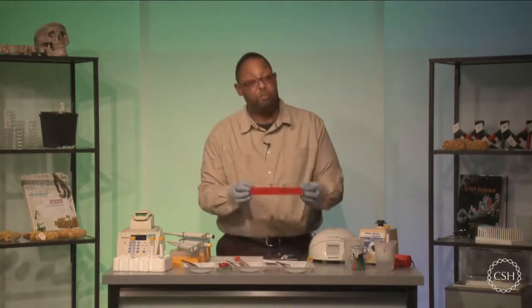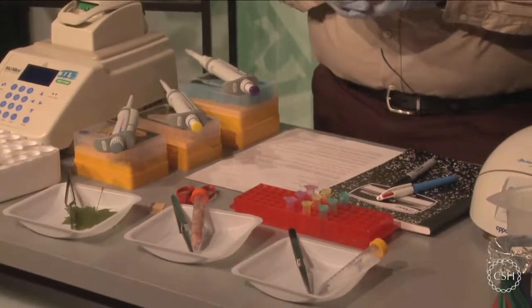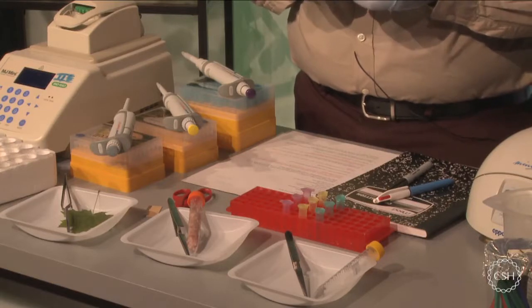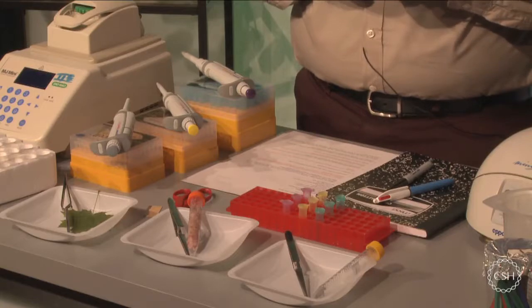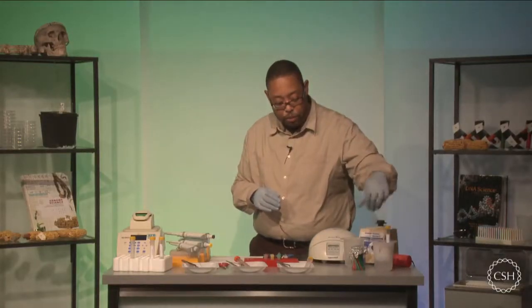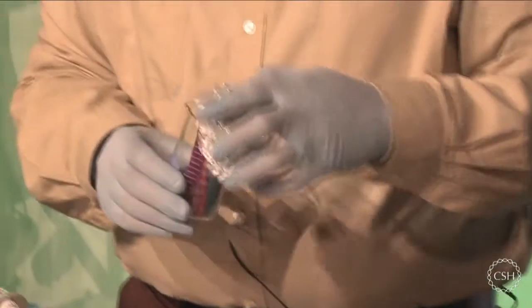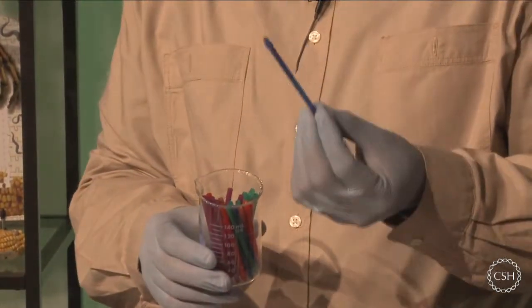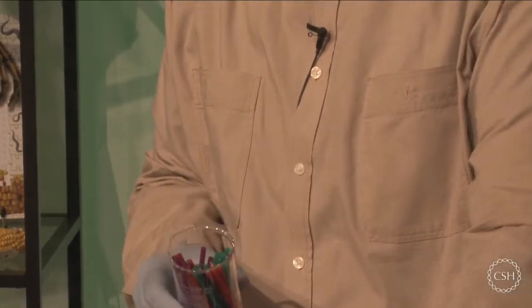We should have a rack with some test tubes available to us. I recommend having at least 3 test tubes, but 2 will suffice. The idea is that we're going to go through a series of steps where we're extracting physical DNA, and we're going to want to make sure we're collecting and discarding any material that's not necessary. We are also going to need a beaker of crushed ice, which you saw me put the wash buffer into. That's to make sure we keep things cold. But we also are going to need some autoclaved pestles. Okay, so you're going to want to make sure you have clean pestles to work with for each experiment. Okay, so I'm just going to put these out because I'm going to need them.